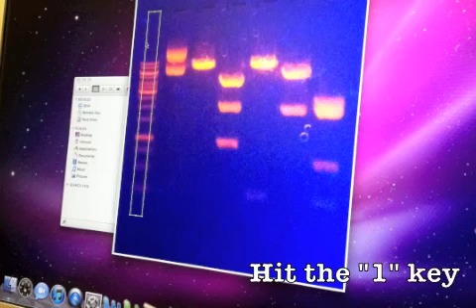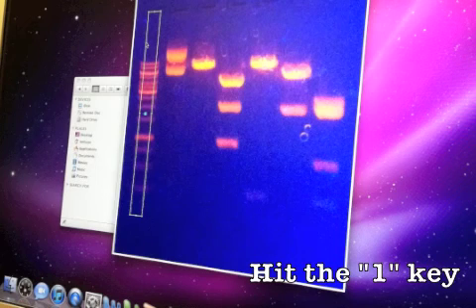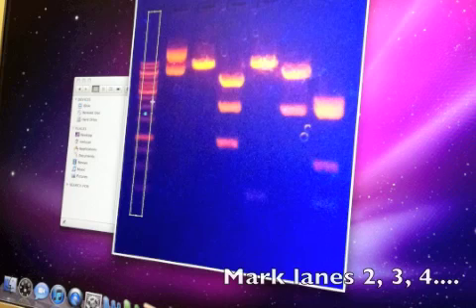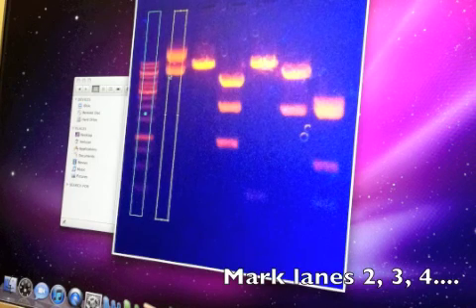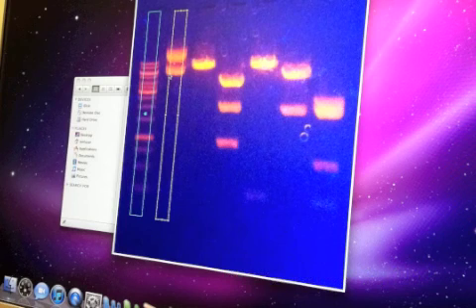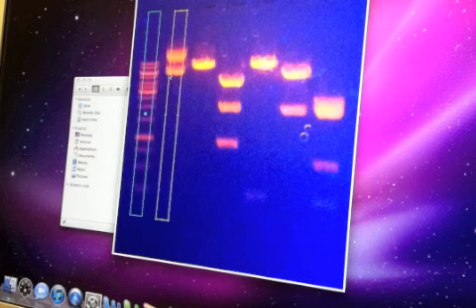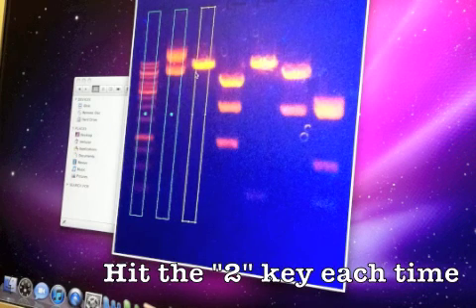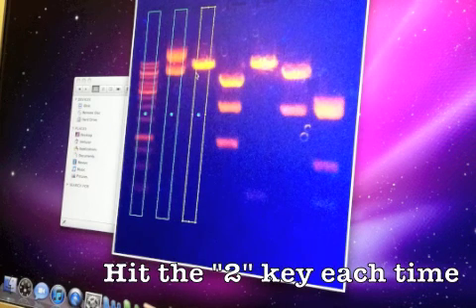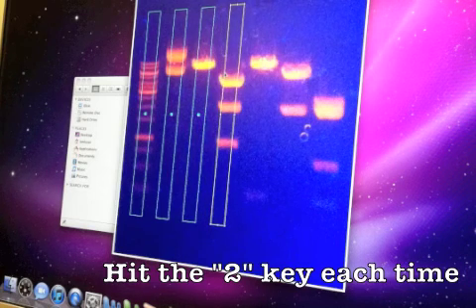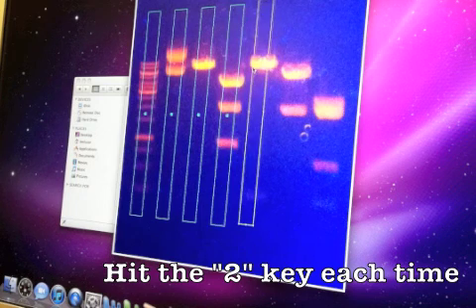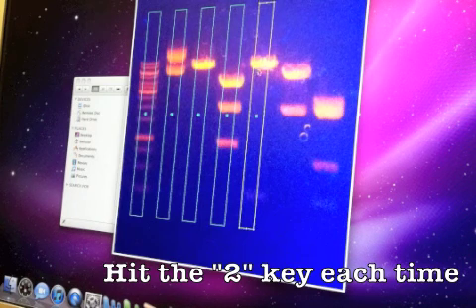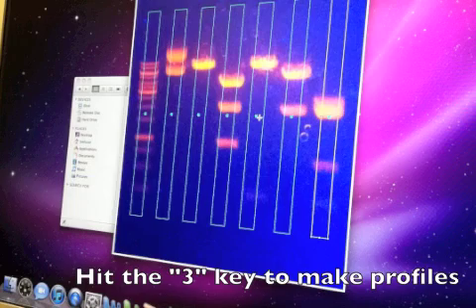To indicate that this is the first lane to analyze, use the shortcut key. I'm just going to hit the one key on my keyboard and that will highlight the lane with a number one. Now I can use the same rectangle, slide it over to the second lane. For all these other lanes I'm going to hit the number two to indicate that these are continuations of the same analysis. Just center on the lane and hit the number two key.